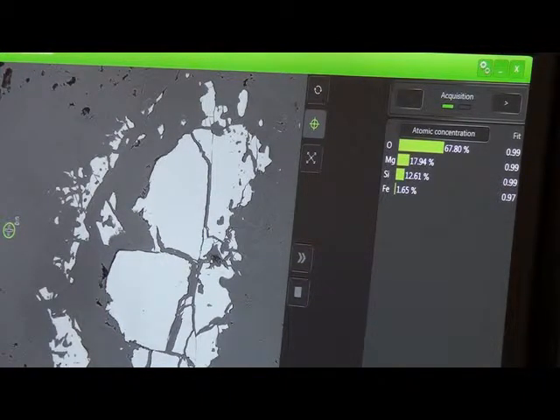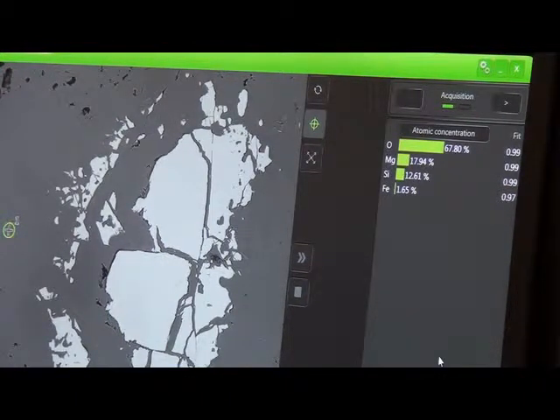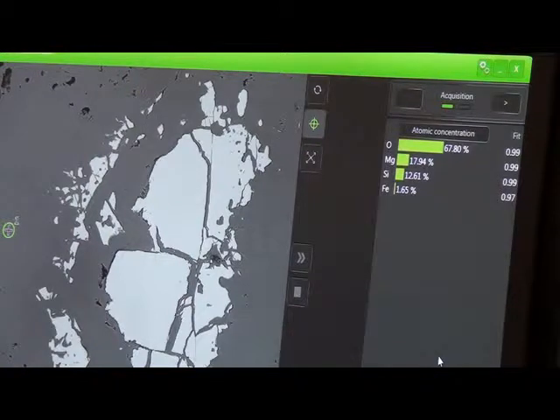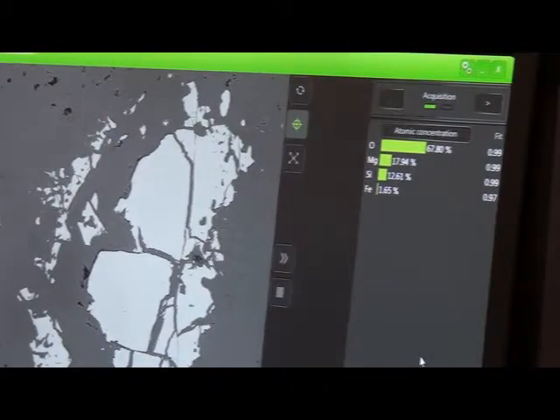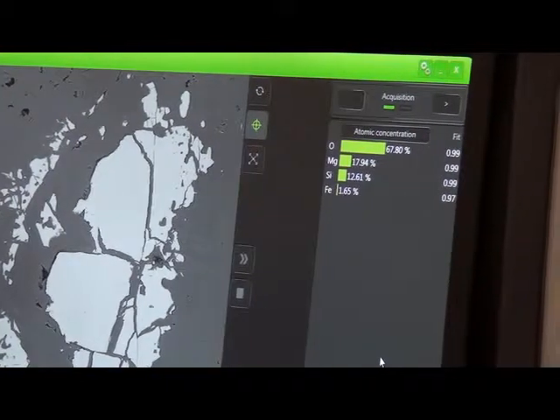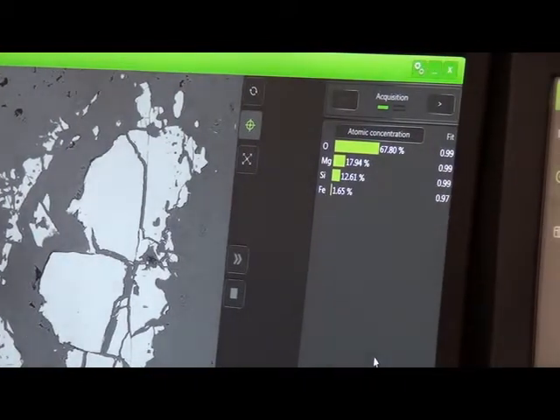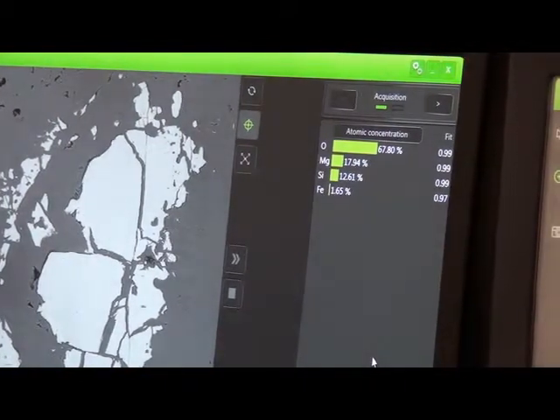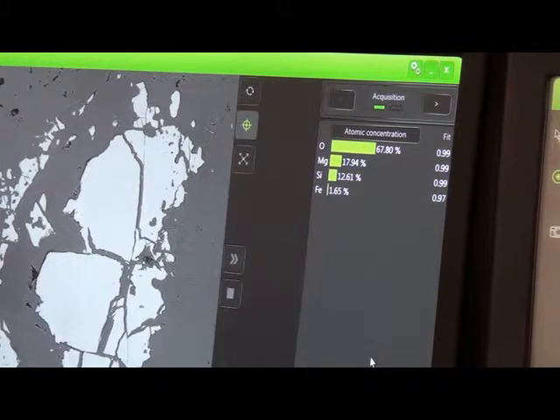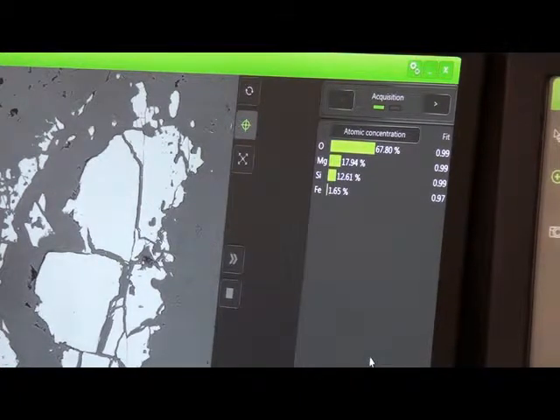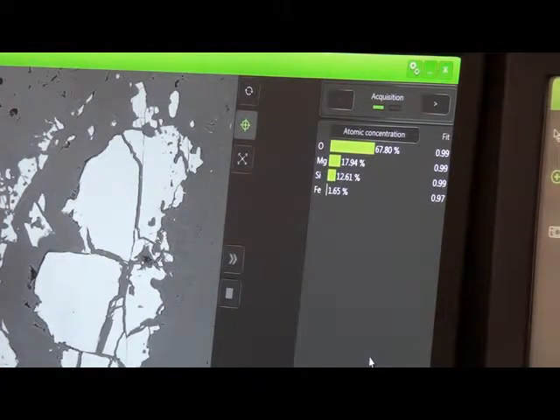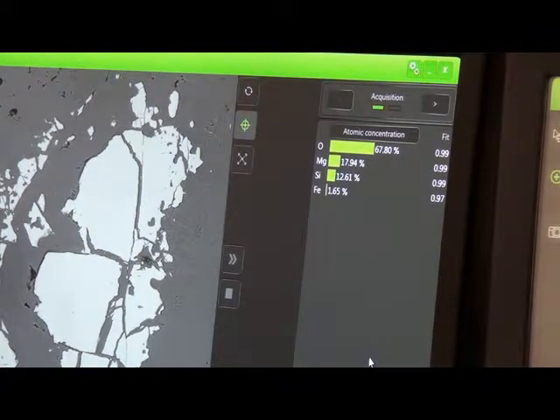This is an altered mineral that probably once was an olivine. You can't see the hydrogen that's present in it. It has actually a fair amount of water in it, but you can't see that on this machine.